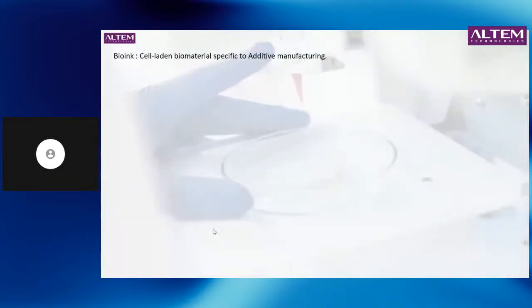So bioinks, hydrogels are constituents of bioinks. These hydrogels are smart structures. They are hydrogels plus a number of materials put together, and the name bioink is given specifically because we need to use some sort of ink to do the printing process, and this is specific to the additive manufacturing space.